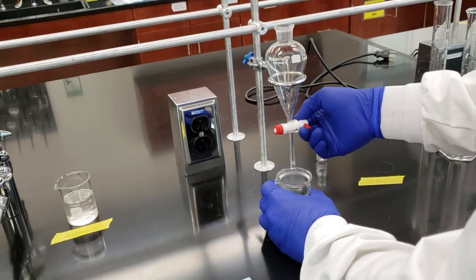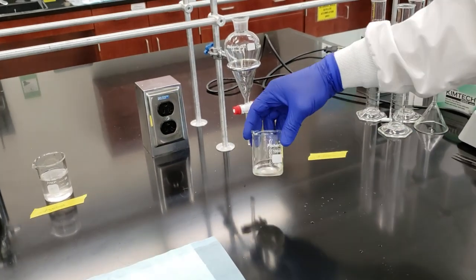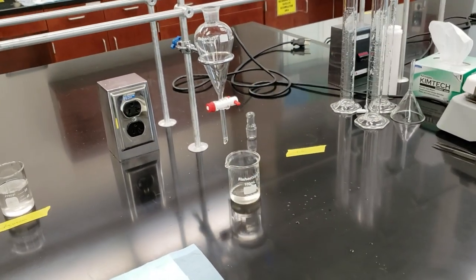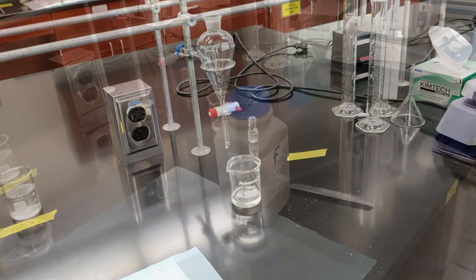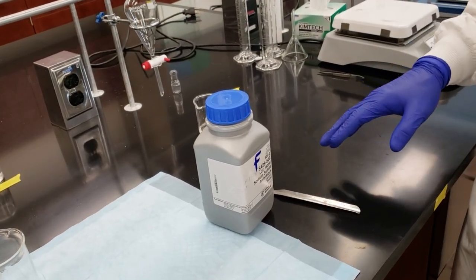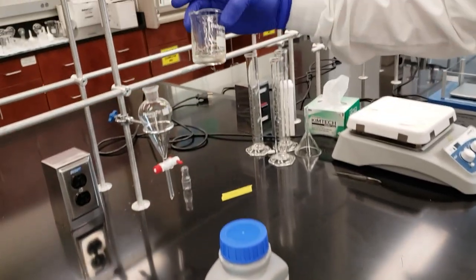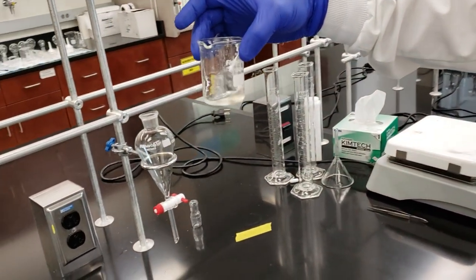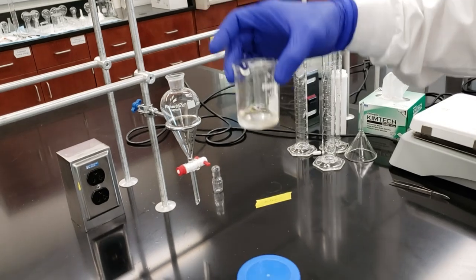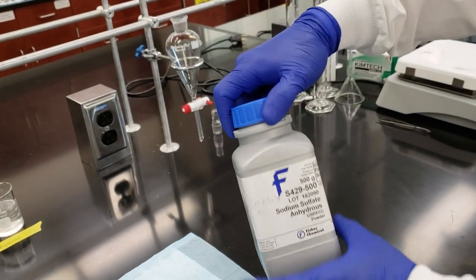All right, so that's it for our extraction and wash. We've got our diethyl ether layer. We'll move on to the next step of our reaction. So the last stage of preparing our product before we go through our filtration process is to dry our diethyl ether layers. We know that we've got a little residual water in here, just as we do for most of our extractions. So I'm going to take sodium sulfate.